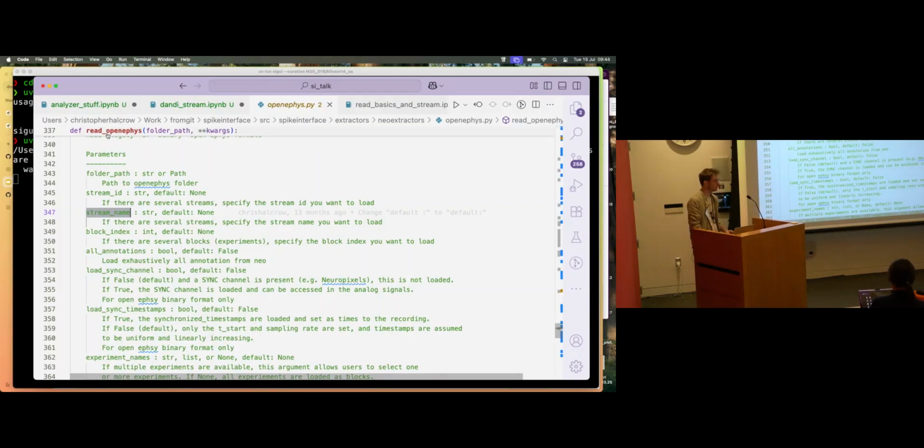Ben, what's the workflow you would recommend currently if you had a longitudinal recording? Sorry, what is longitudinal? Meaning you had multiple sessions that potentially were recording from the same neurons, and you wanted to see if you could match them across sessions. What's the time difference between the recordings? I don't know, it's more of a hypothetical question. I think I talked to a lot of groups that are interested in this kind of thing, spanning from two sessions in the same day to up to a month.